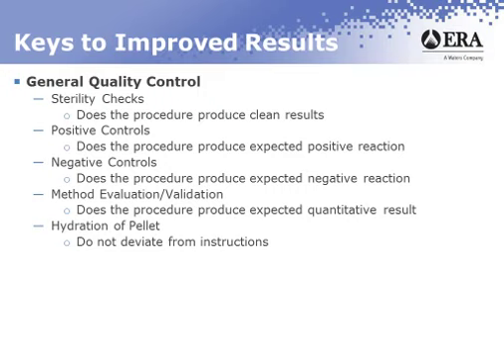Our sample comes to you, as I've discussed, lyophilized with a phosphate buffer. Once you rehydrate it, you've got about 30 minutes to perform your analysis. The reason I say that is because the pellet does have certain carbon sources in it. And when you dissolve that in the phosphate buffer, there is the possibility that the organisms, once they are somewhat resuscitated, could use the source of carbon in the pellet as something that will cause them to grow.